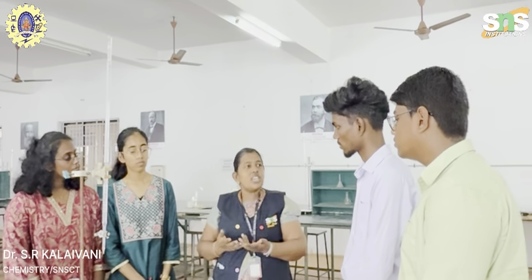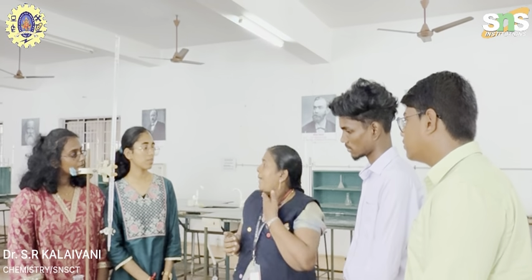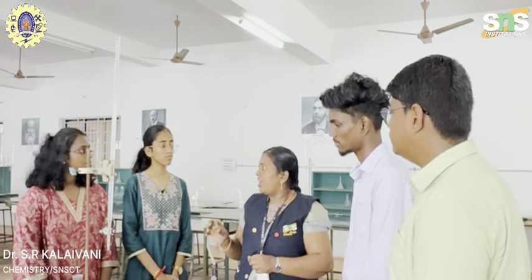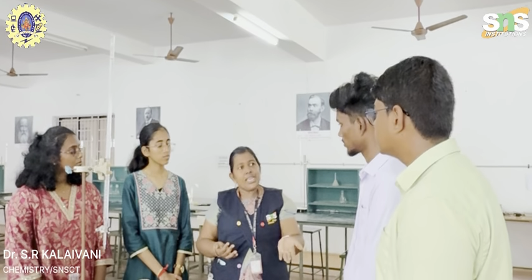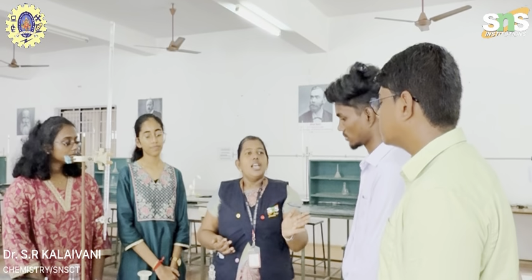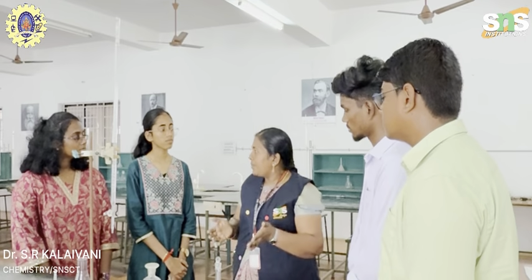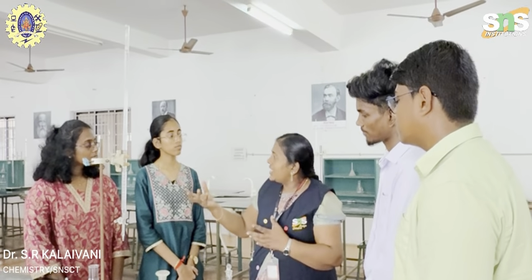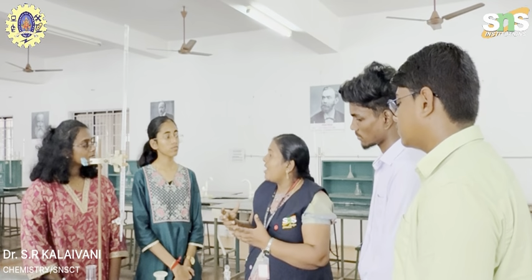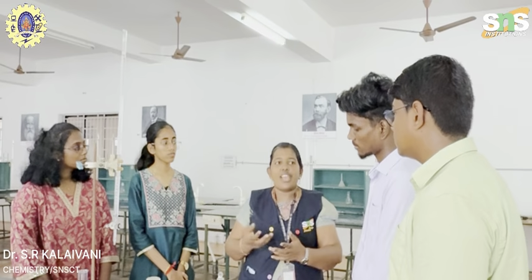Generally, what are the units of hardness? ppm. ppm means parts per million. This is the major unit for hardness. Another unit equal to ppm is milligram per liter. These are the units for hardness. From this experiment, we can find out whether the water for our domestic purposes is soft water or hard water.